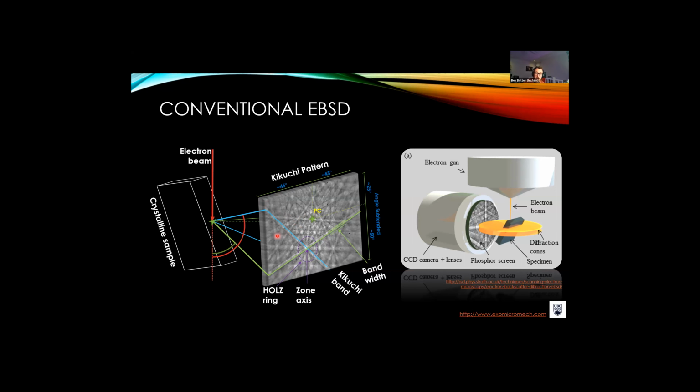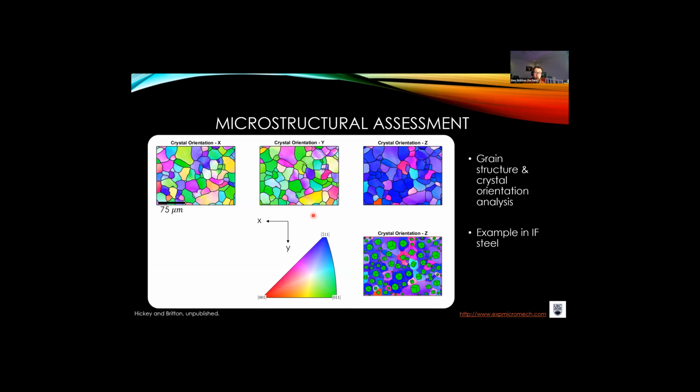Those of you who might be familiar with Kikuchi pattern analysis for thick crystals in the TEM probably spend a lot of time using them as sort of roads to find out where the crystal is oriented. But you'll only be looking at a small, narrow view in the TEM. When we do this, we can do it in a rapidly automated manner. The combined efforts of lots of people have created some commercial software and open source tools that enable us now to index and represent this data.